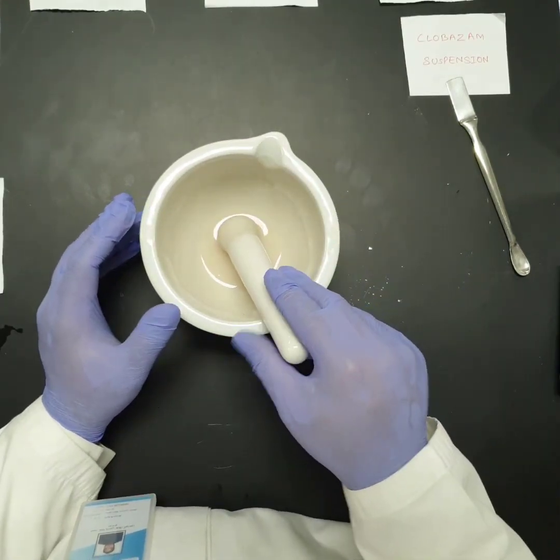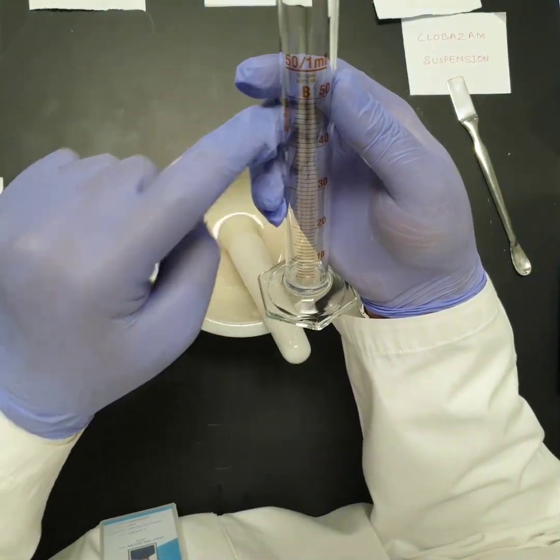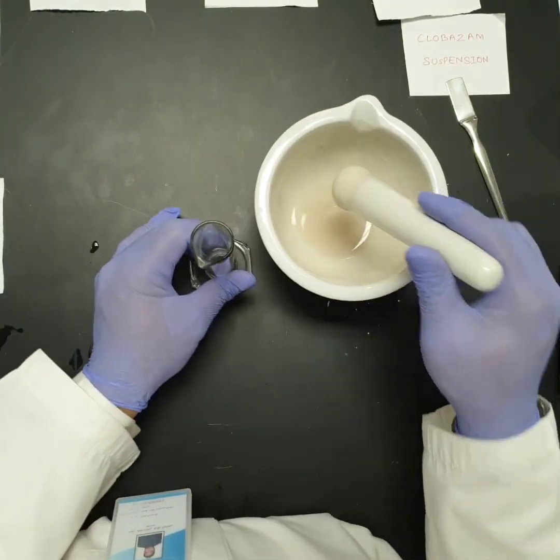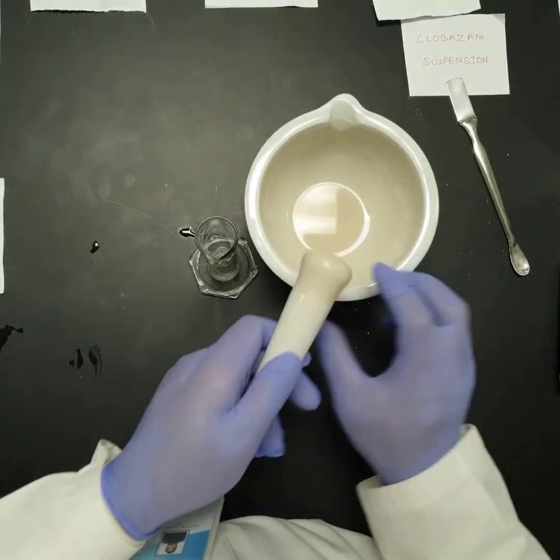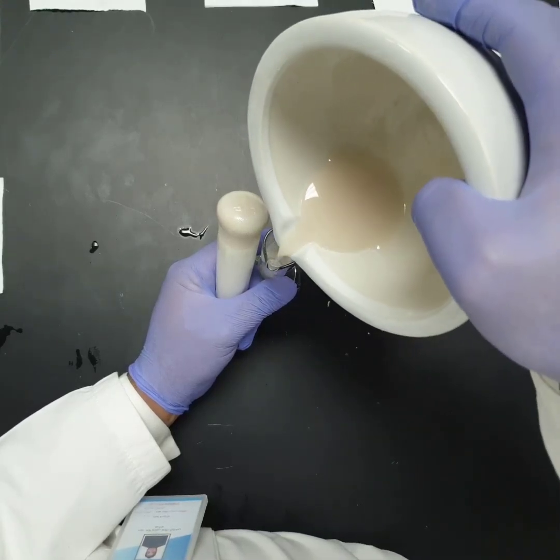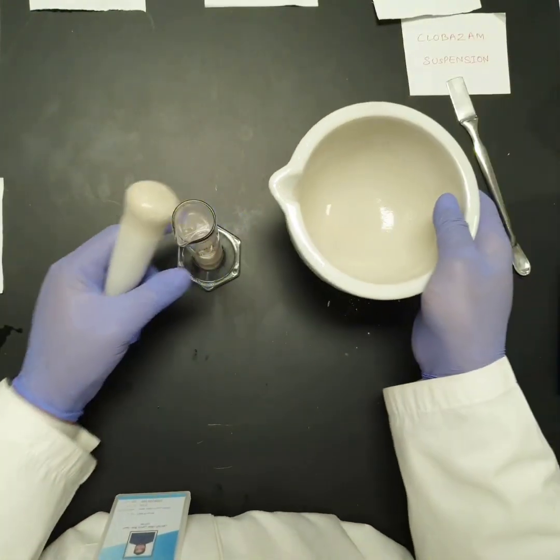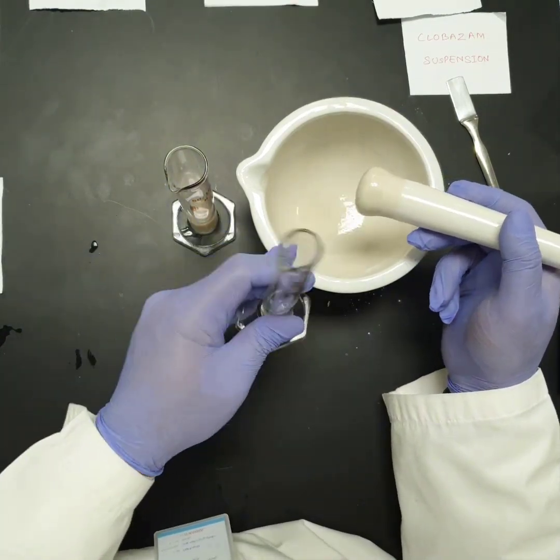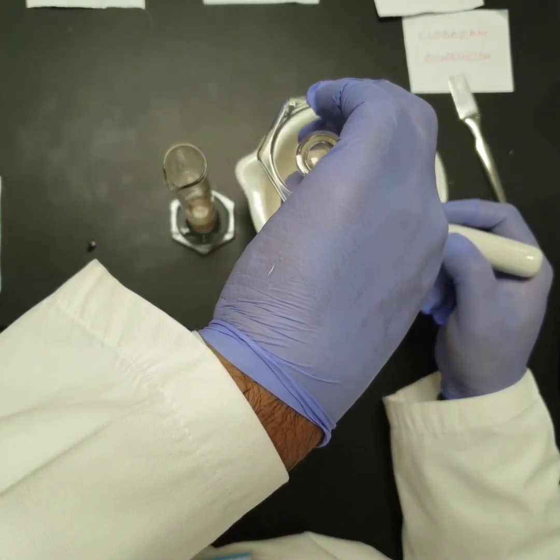Now it's time for me to move to another step, which is the third step of our procedure. I have to take a graduated cylinder of 50 ml because our final product will be a total of 50 ml. So now I am going to transfer the contents of the mortar to the graduated cylinder. As you can see, it is now pourable. I can pour it easily. So after pouring, I have a little amount of syrup left. So I will add that amount of syrup into the porcelain mortar so that I can wash it.